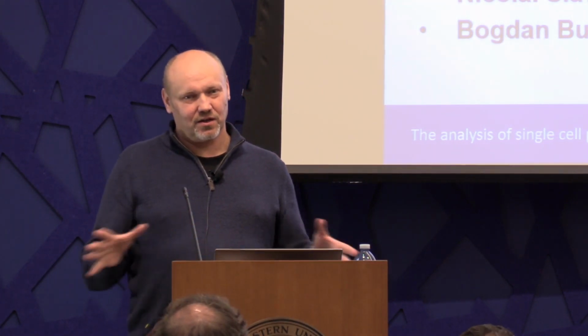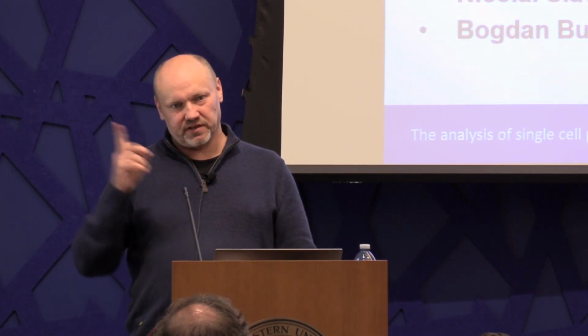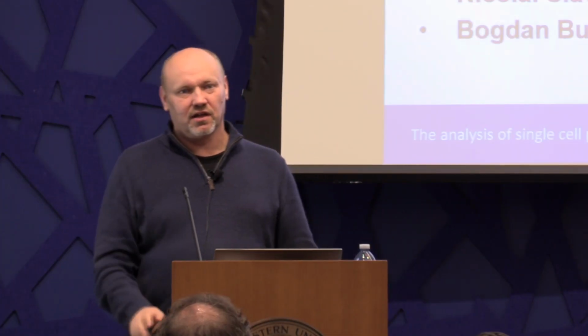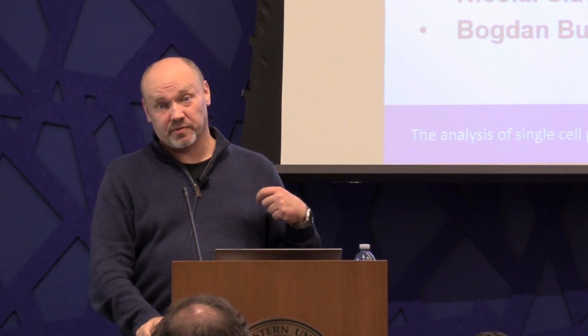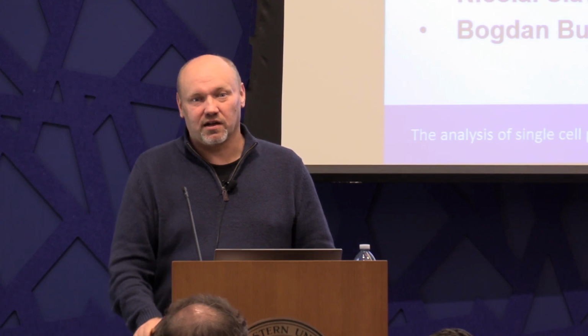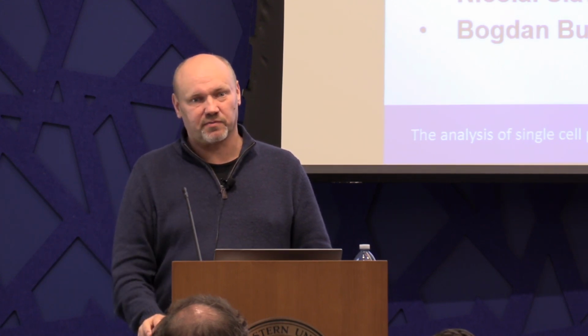So I mean, there are a lot of next things to do which are obvious and don't require thinking. They just need to be done. So one is that we feed through the collision energy. The other thing is that at the moment we are only doing predictions for unmodified peptides and methionine oxidation. But it's easy to go beyond that by just declaring the modified amino acids as 21st, 22nd, and so on amino acids. At the moment, it's also heavily biased toward tryptic peptides because that's what you find in Pride. So it just needs to see non-tryptic peptides, but there's no conceptual thing one needs to do, basically, right? Calibration is not necessary because that's MaxQuant taking care of, basically.